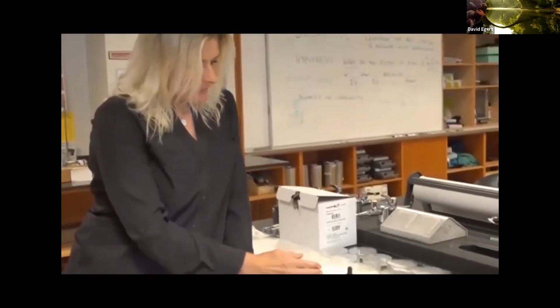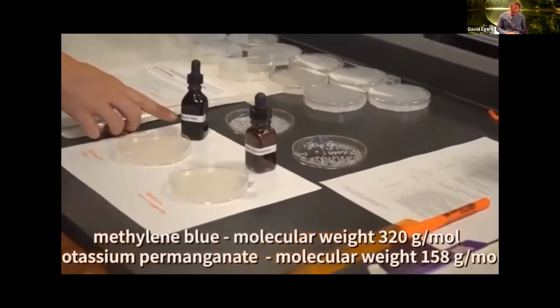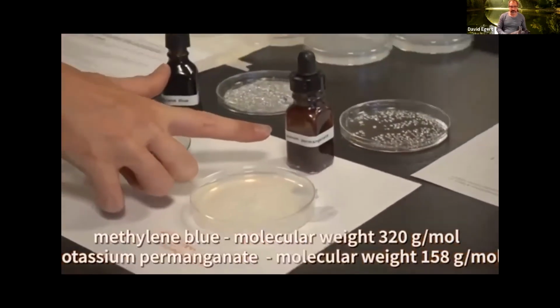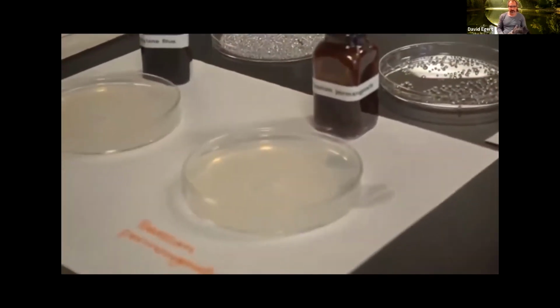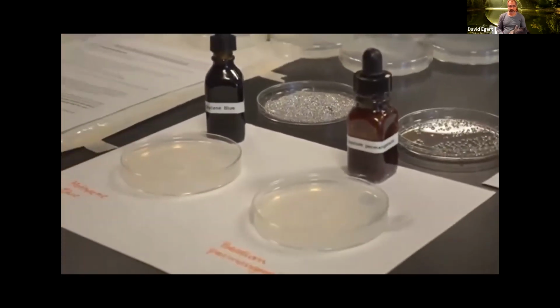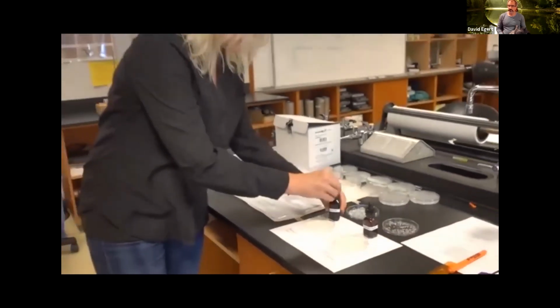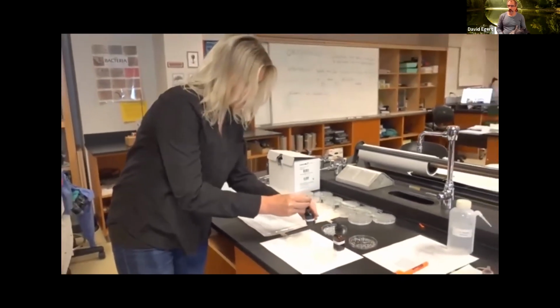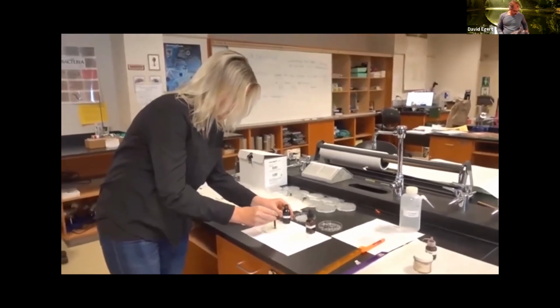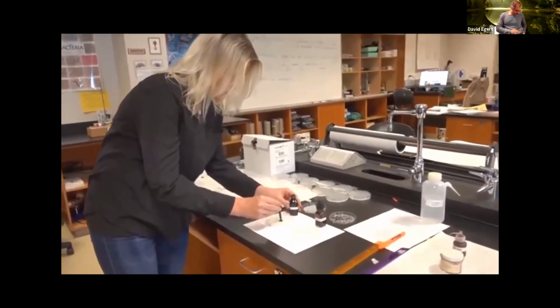So the idea here is that the molecular size is much larger of the methylene blue than the potassium permanganate. And so we want to see how that will affect the diffusion and diffusion rate in this agar plate. So I'm going to fill up the well with each of these dyes, and then every half hour we're going to come back and measure how far it has diffused through the agar.